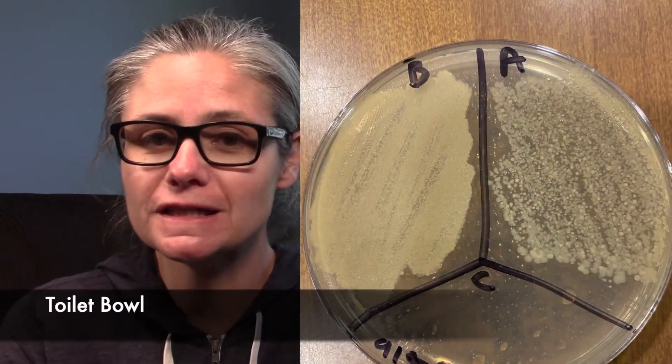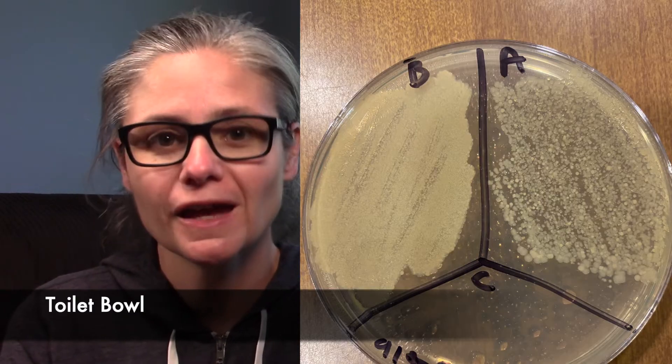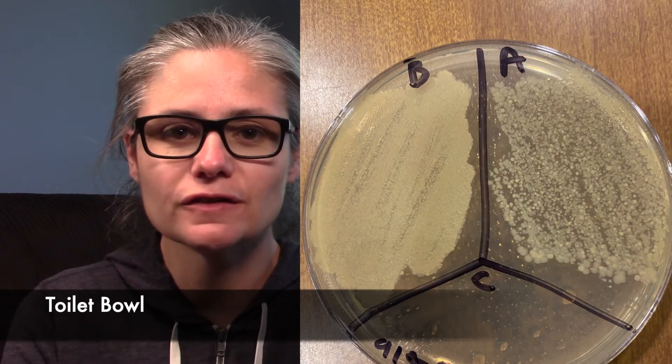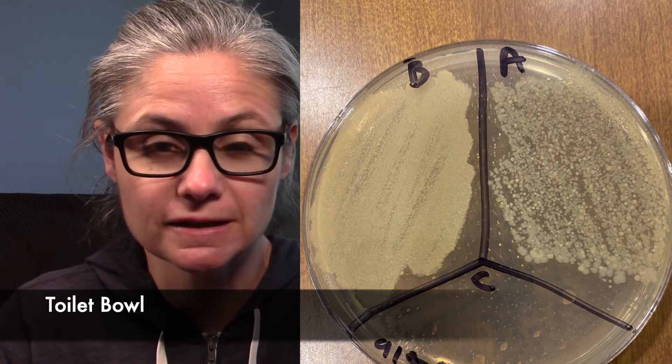Now for some results. Let's start with the toilet bowl. Here we can see the before section — there's a lot of bacteria, as we expect in the good old toilet bowl. In the after section, there is definitely a decrease in bacteria, but it's not quite as significant as I would have expected it to be.